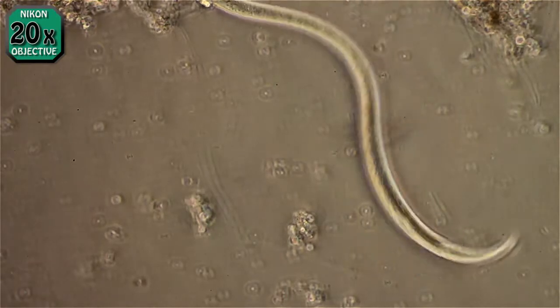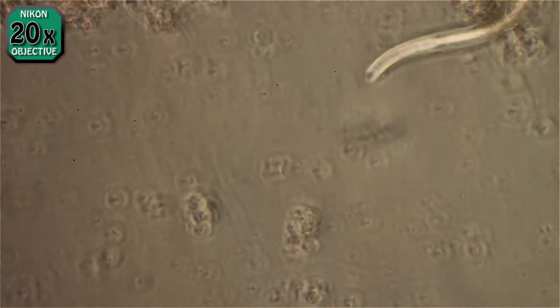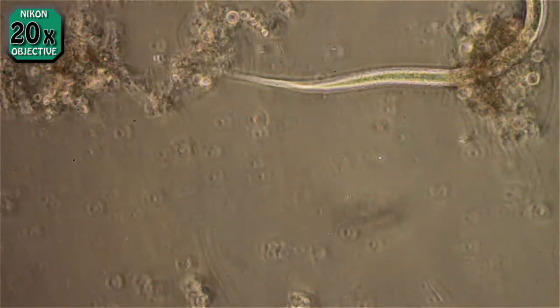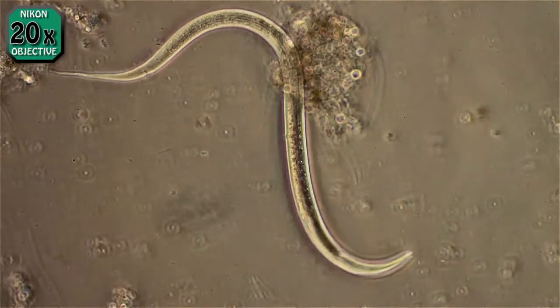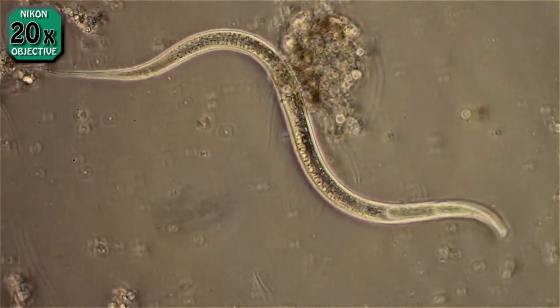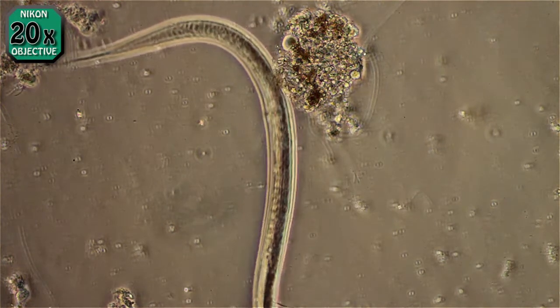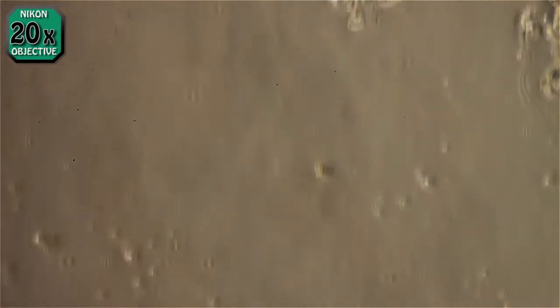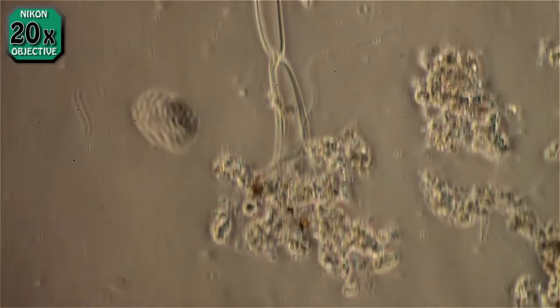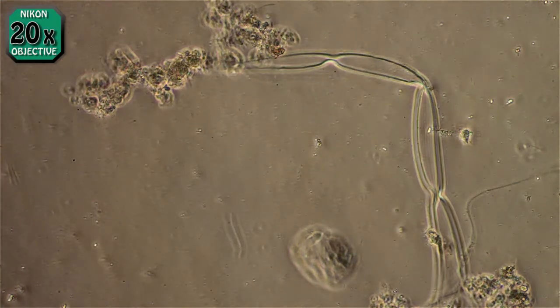I'm using a Nikon Fluorophot scope with a Canon T1i DSLR in video mode. I'm using a phase contrast condenser — this would be in phase 2 at this point — using Nikon phase contrast DL Plan Achromat lenses.